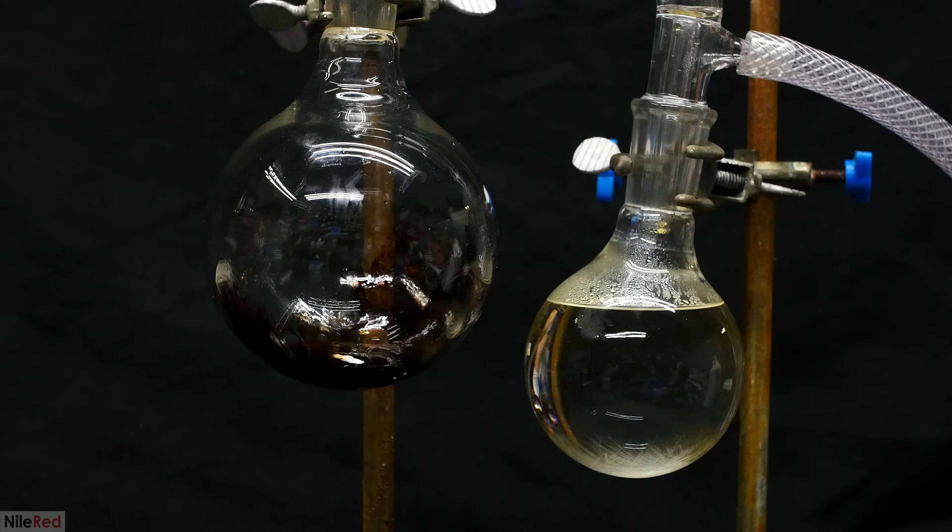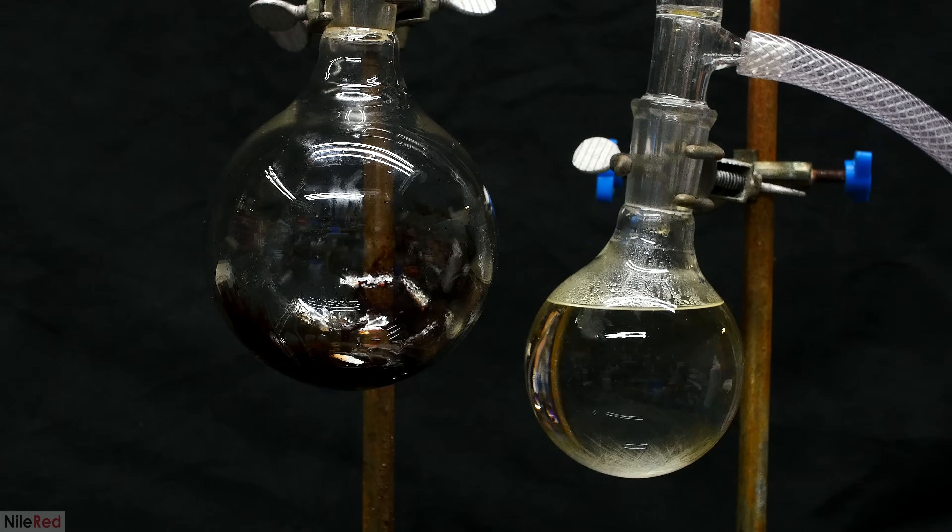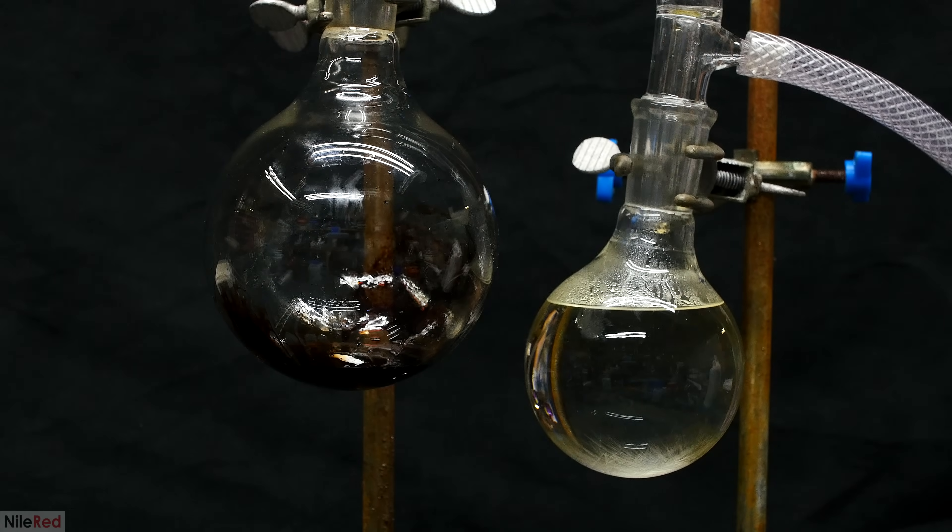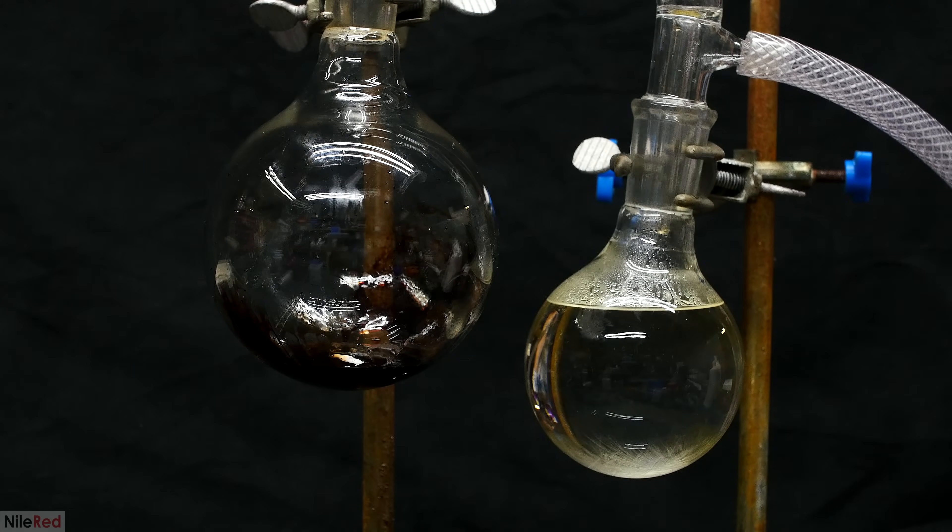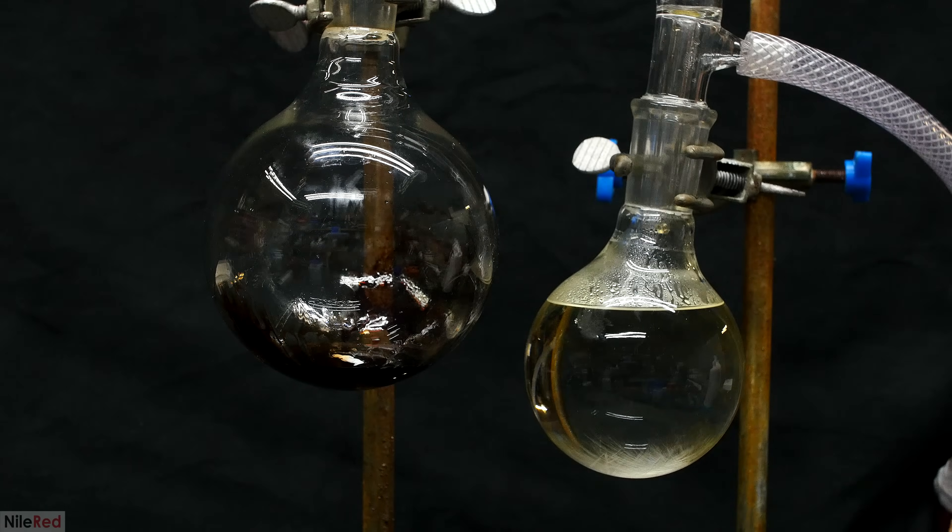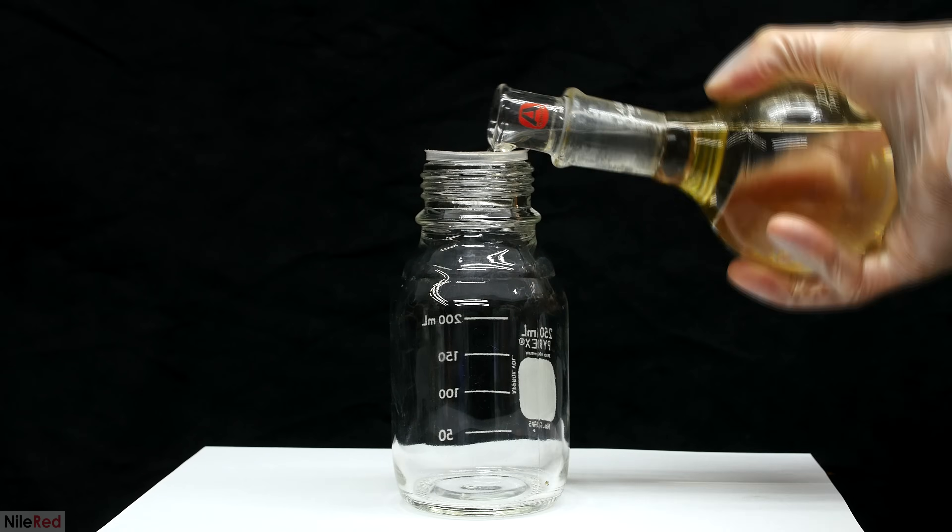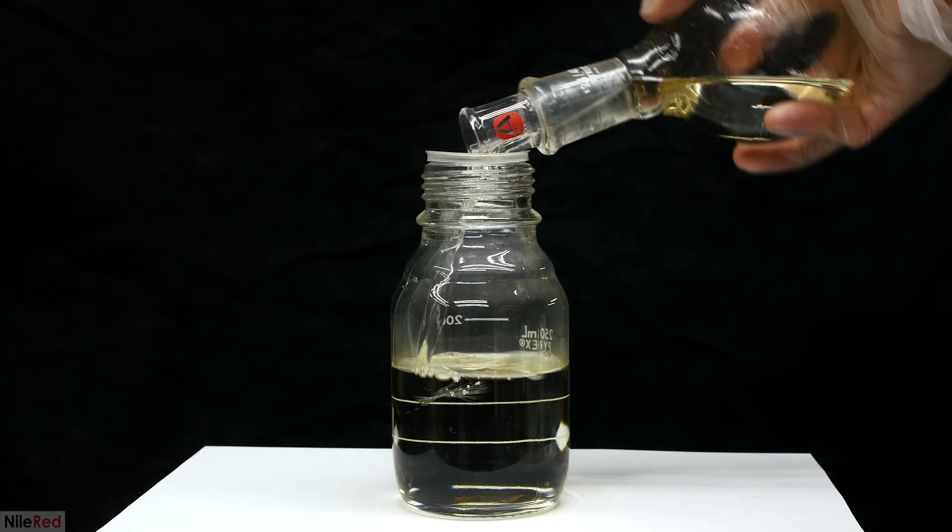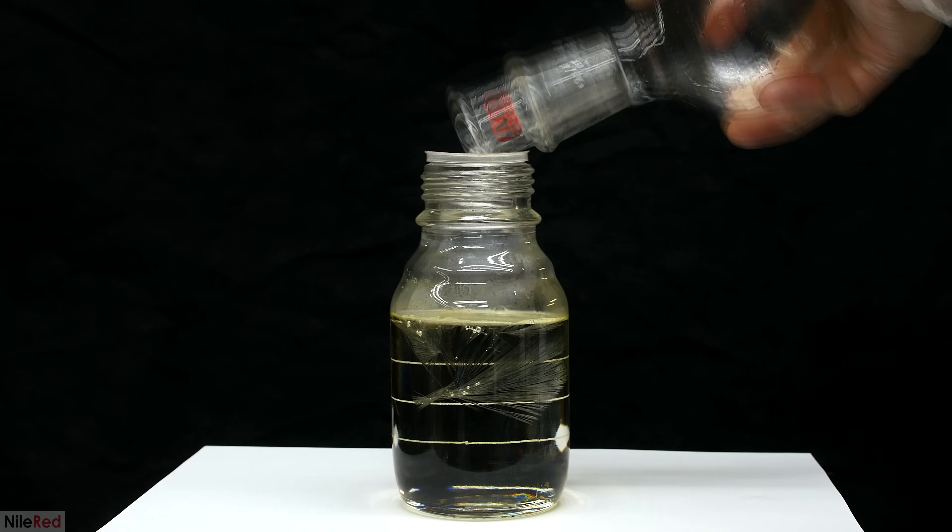If we look at the bottom of the receiving flask, we can see that the phenol is already starting to crystallize, so it's probably a good idea to transfer it to a bottle before it completely solidifies in the flask. The phenol is poured into a pyrex bottle, and we wait for it to crystallize.